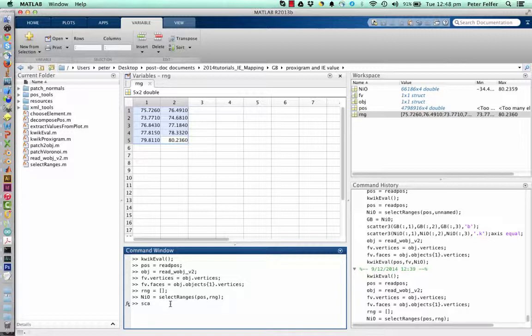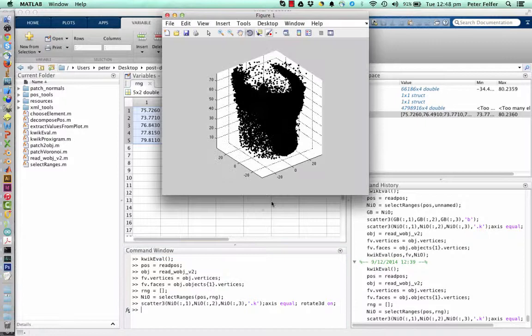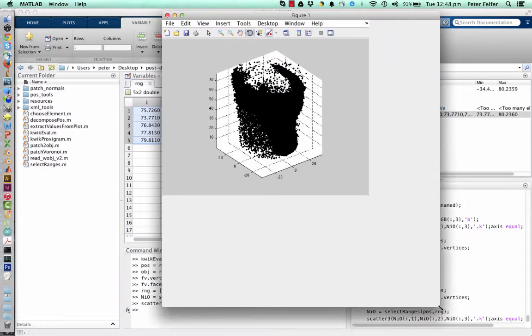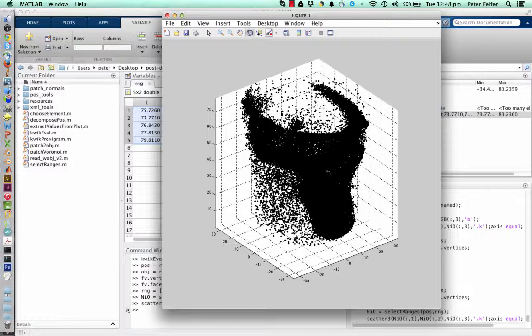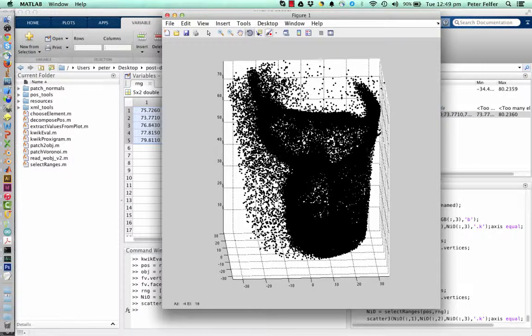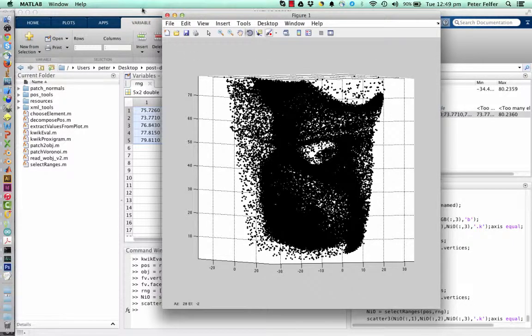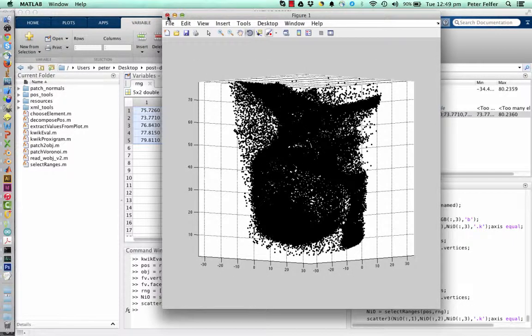So it's the scatter plot. It will get a little bit choppy for MATLAB to display 66,000 points, but we can if we need to. And that's actually exactly what we wanted to see. So this is the nickel oxide at the boundary. You can see it's not super fast at rotating this amount of points, but anyway, we're just able to convince ourselves that it's actually the atomic positions that we want.